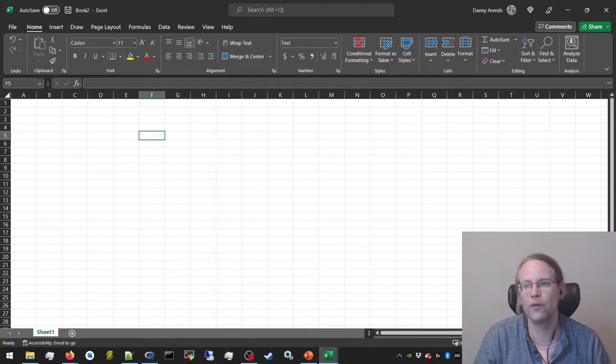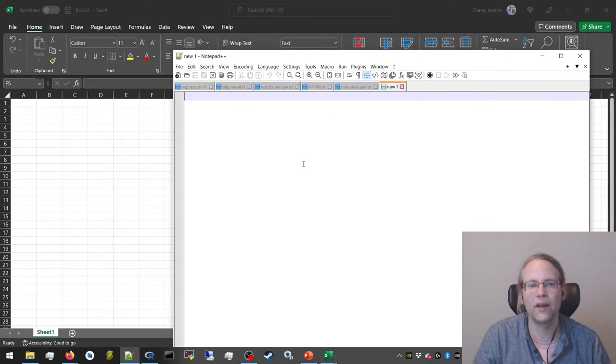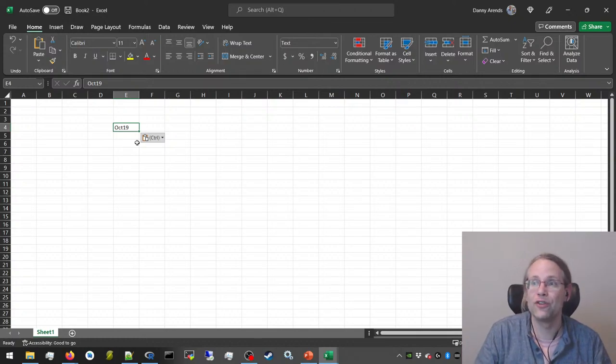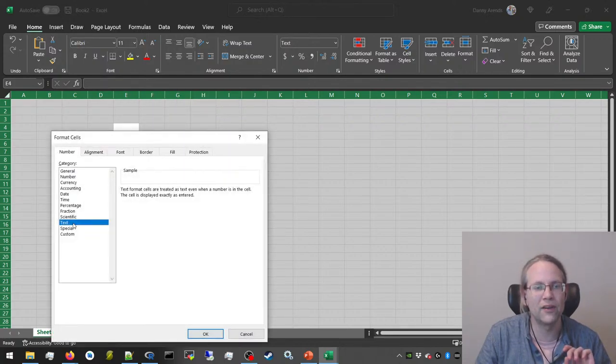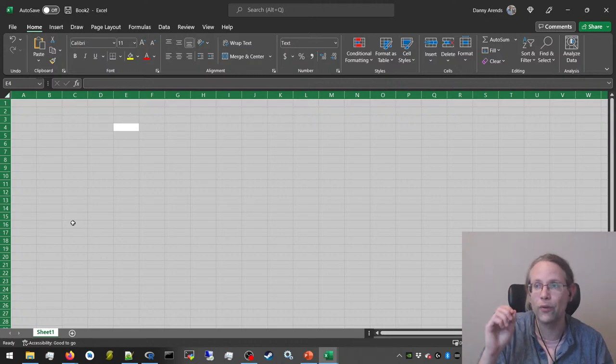And now, if I would paste, let me show you guys this. Right, so now if I would take this and it would say oct19, right, which is one of these genes which always gets converted to October 19. If we now put it in, it will say oct19 because it's a text field. Of course, the numbers that we have, we should then convert back, right? So the best way of preventing changes by Excel is just selecting the whole thing, right click, format cells as being text. Because now anything that you will paste in, it will just treat as text. It will not correct dates.